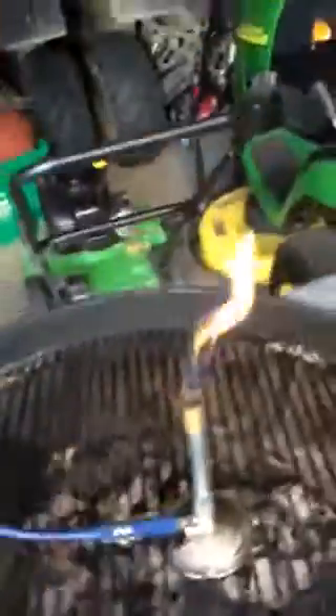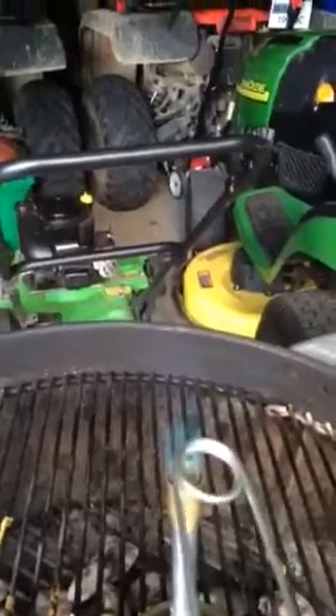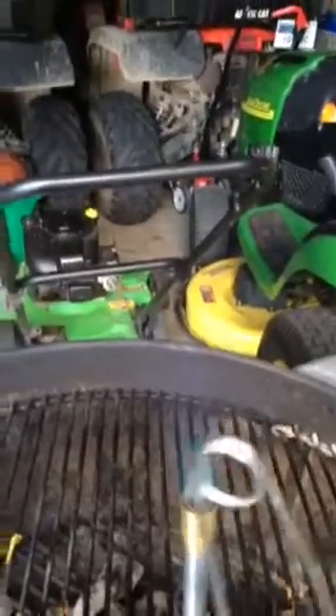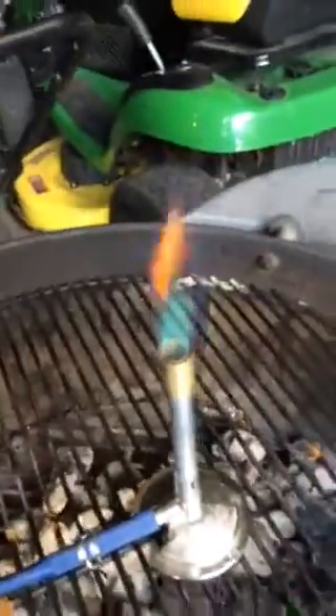It's still cold, so I can use this as a candle if I want to. And there you go — this is a clean burn flame. In the middle of the flame, that's the hot part and the top is where all the other gas gets burnt up. Let me show you medium — nothing too special — and high.